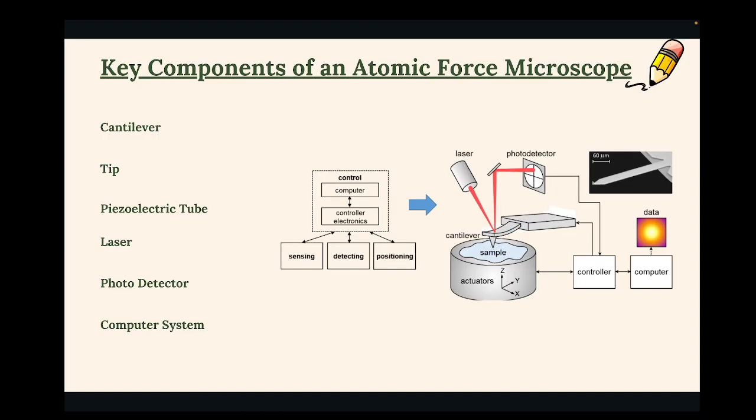The pen nib is made of thousands of atoms, but the tip of this cantilever is made of only 7 or 8 atoms. Because it is made of so few atoms, the interaction between the atoms of the tip and the sample is used to detect the topography and determine the nature of the sample. So how fine the tip is, is very essential.